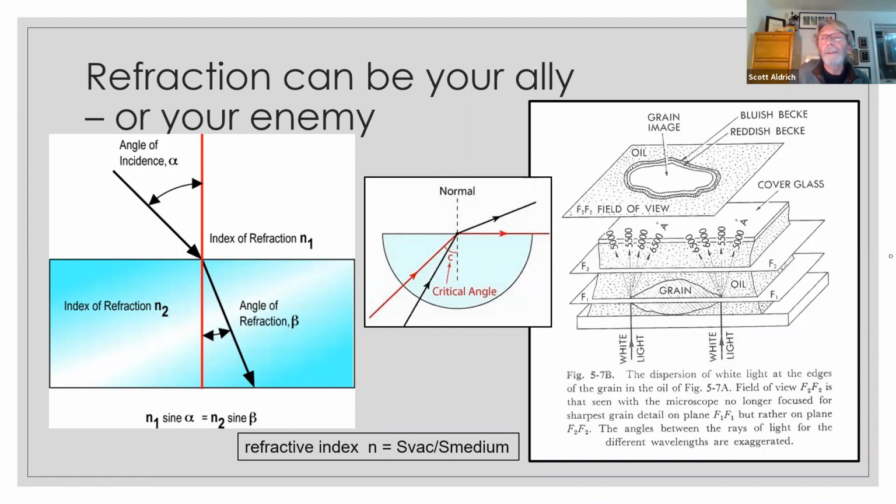That is, when the light ray is passing between two substances, depending on the refractive index of the two substances, you may have the light passing through, being refracted, being reflected, being trapped. And so that could be used to your advantage. On the right-hand side, this diagram from an older textbook is showing you cut planes of focus in a microscope.